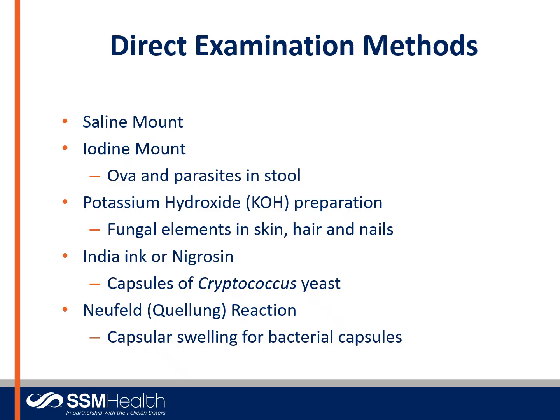And typically in most microbiology labs, they might use the KOH as part of a fluorescent stain that gives even better highlights of the different parts of the fungus. But it's possible that the KOH alone might be used, even sometimes in the emergency room. Physicians, particularly if they are dermatologists and are familiar with what they're looking for, might do direct smears if they have access to both the reagent and to a microscope.